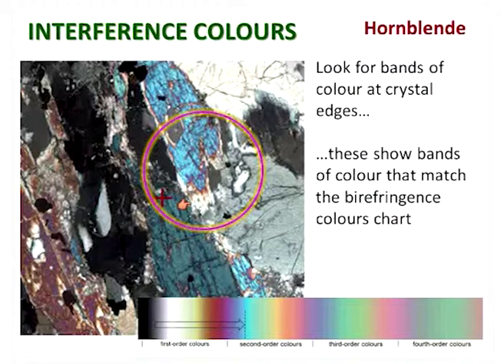But then there are other areas of the slide, for instance just to the right of this end crystal in here, just inside the circle, which are very confused, and you'd be hard-pressed to say exactly what you're seeing there. It's probably the ragged edge of a very irregular crystal. In some cases it's cut right through that crystal and you're looking through to the crystal underneath. You might be seeing inclusions, or just a bit of crystal that's been fractured and moved around during the slide making process.